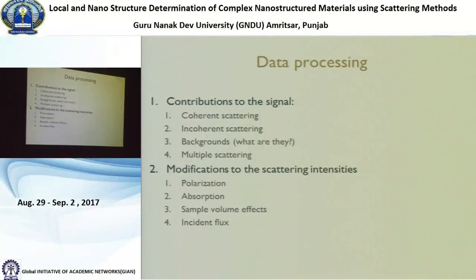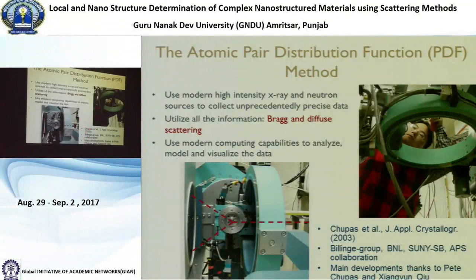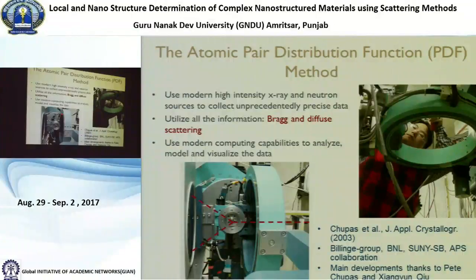There can also be secondary scattering. An example of secondary scattering is that let's say there are some X-rays that were scattered off a slit up here, and then they go up here and scatter off this thing, and then they scatter into our detector. So X-rays can get into your detector from all over the place, and we have very high energy X-rays, and they're not very strongly absorbed. Neutrons are a similar problem.